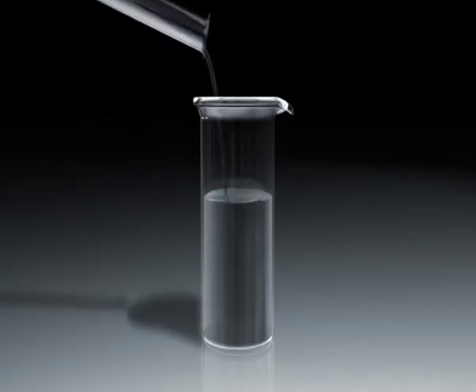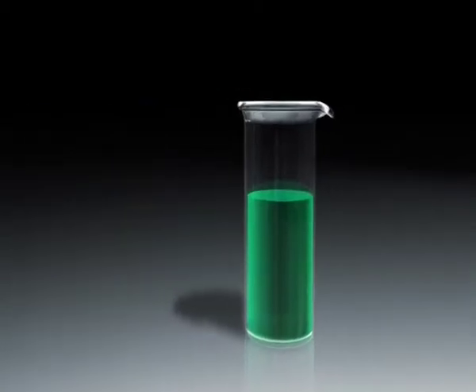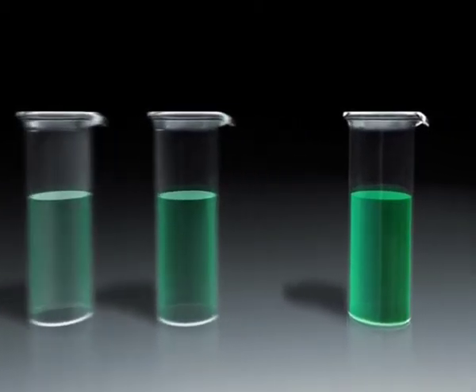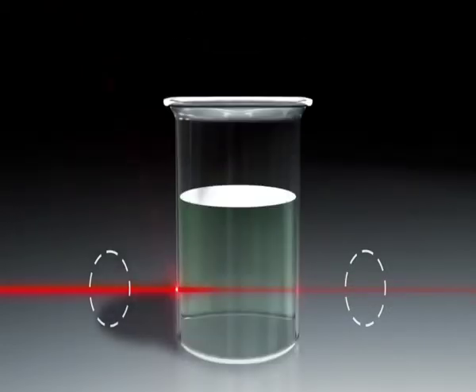In a colorimeter, a beam of light with a specific wavelength is passed through a solution via a series of lenses which navigate the colored light to the measuring device. This analyzes the color compared to an existing standard. A microprocessor then calculates the absorbance or percentage of transmittance. If the concentration of the solution is greater, more light will be absorbed, which can be identified by measuring the difference between the amount of light at its origin and after passing through the solution.